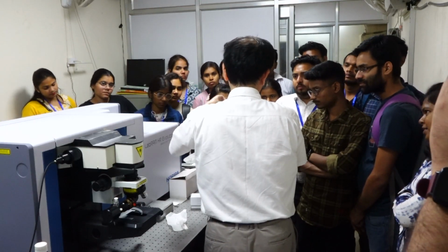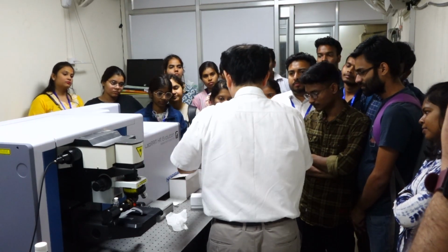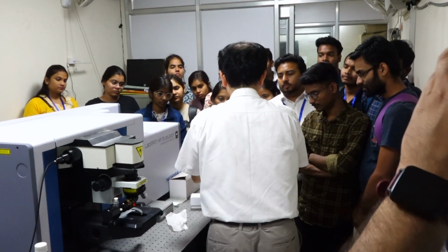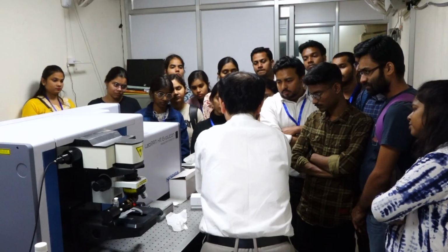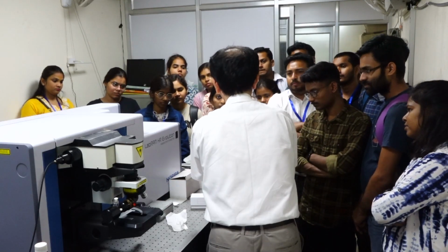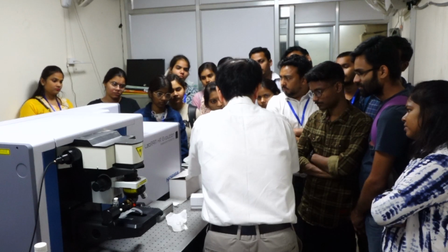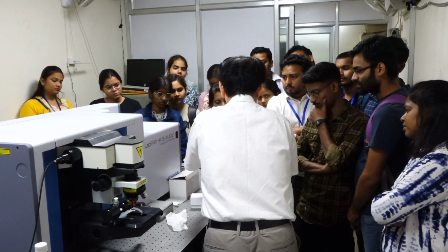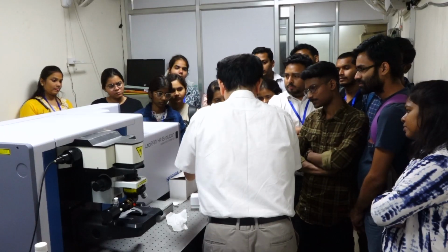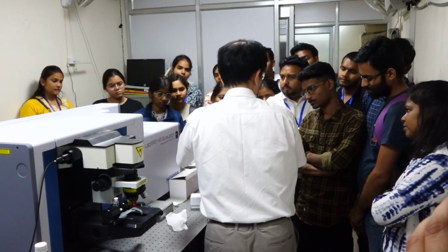It depends only on the numerical aperture of these optics. If these optics can gather signal from a larger solid angle, then the signal count becomes larger. If this is a small lens that only gathers a small solid angle, then it is less efficient.